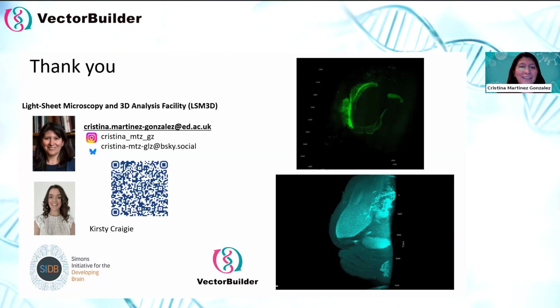I would say no. The only ones I would say are comparable are the electron microscopy grade formaldehyde, but those are small and very expensive. It's okay if you perfuse a mouse, but it will be very expensive to perfuse a rat because you need a much larger volume. So I would say make it fresh.